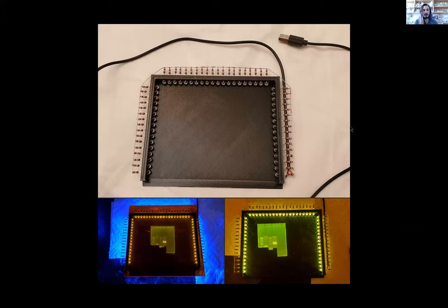So I'm like, cool. These LEDs are 33 cents. You need about 50 of them, so it's pretty cheap. The acrylic panel is about $6 for 1 square foot, and really, you just need this much to cover your phone, so you can get smaller pieces, because at the end of the day, we want to take a picture of it, not just stare at it, right?